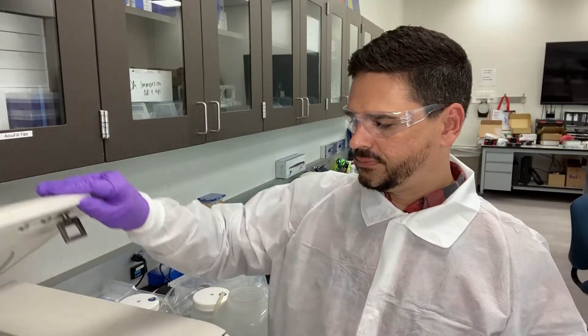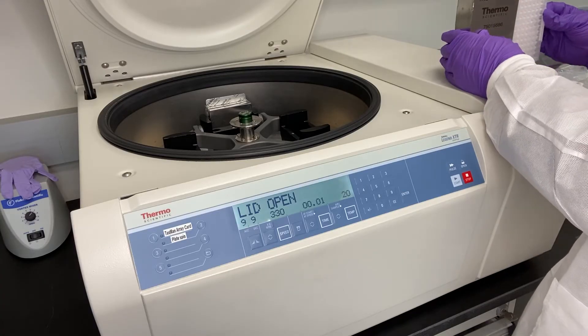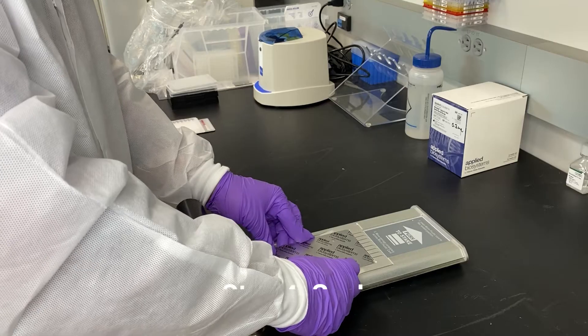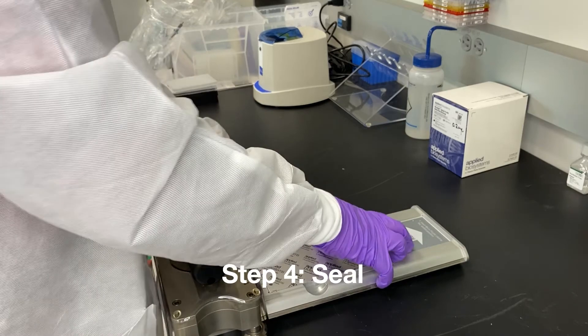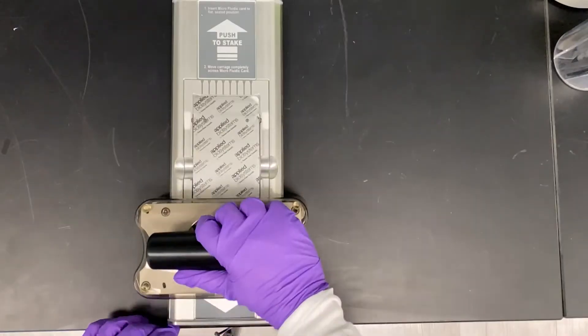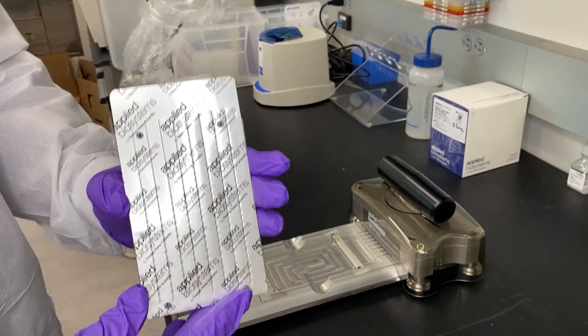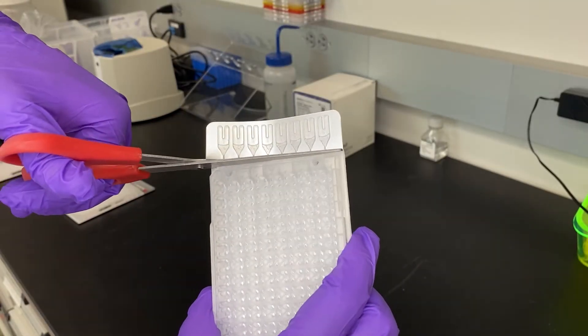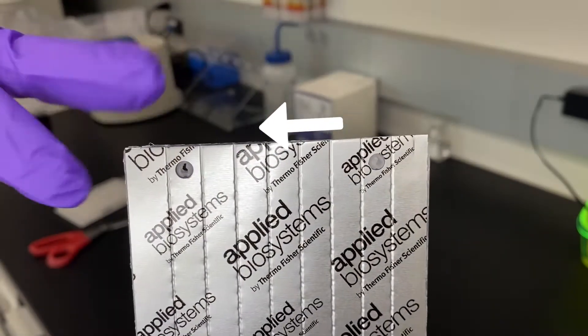When our spin is finished, we'll check the ports for proper filling. The samples should be consistent throughout each reservoir. Next, we'll seal the main channels of the card with the sealer — push once forward with the carriage and that's it. Then we'll remove the card and cut off the fill reservoir strip, making sure to cut smoothly and leave a clean edge.